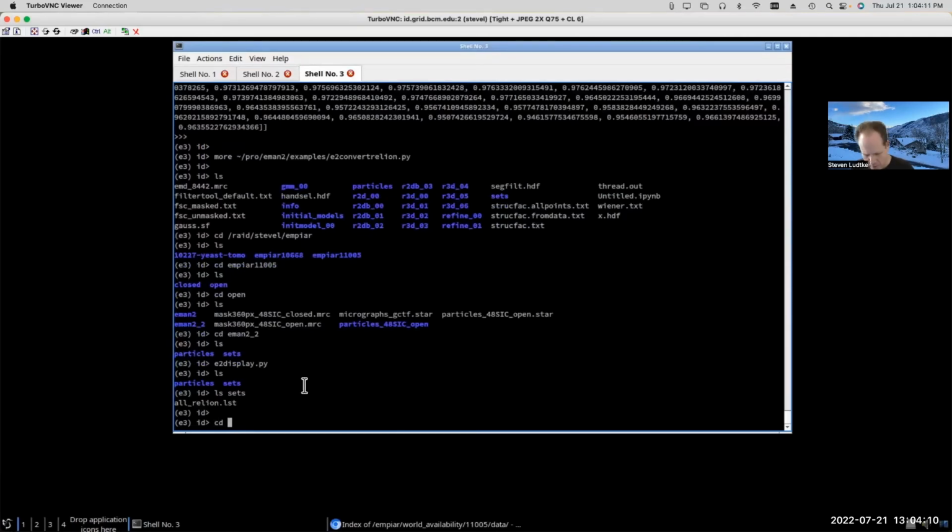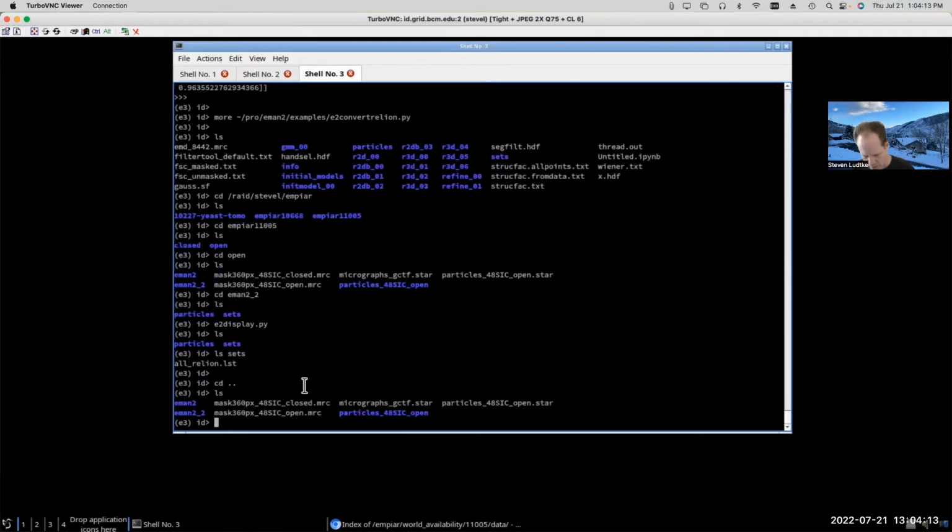Yeah, we've been going over an hour, so I'm not going to go too much longer today. Maybe I'll just make one last interesting point related to the data compression paper. The raw data from micrographs, raw particle data, compresses pretty well with the strategies outlined in that paper, but it's about a factor of 4, and that's great. A factor of 4 less disk space for your raw particle data is obviously very useful. Certain types of files, like 3D volumes, which are generally masked, compress even better than that.